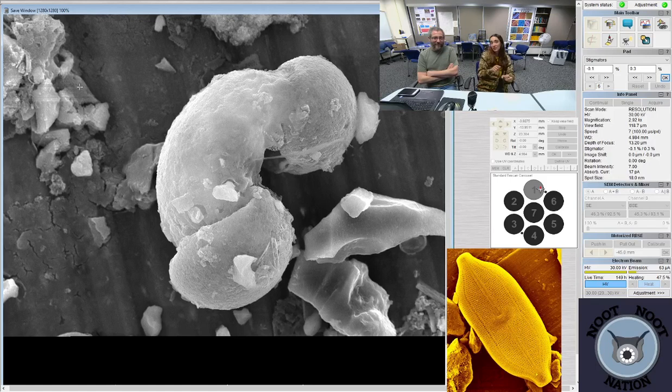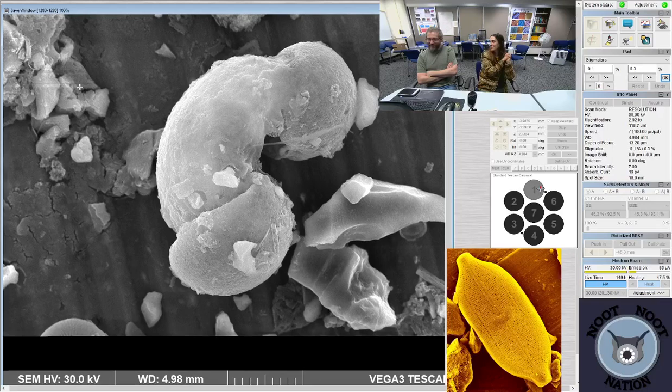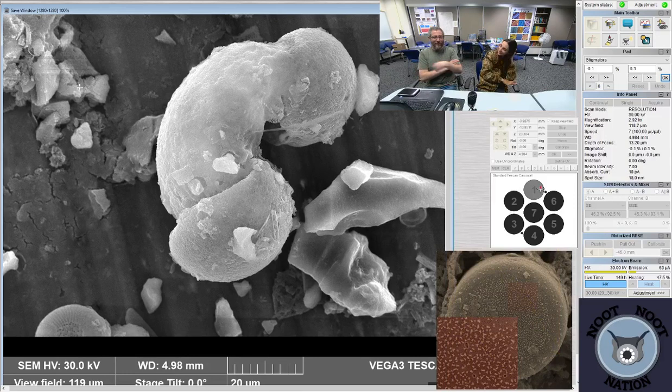It was like, if you didn't take all the carbonates out and then you put the acid in, it's going to explode. And I was like, okay, oh my god. As opposed to what we do in our lab, which is like, we'll just squeeze a little of this in and stick it on a shelf and come back in like 2 weeks and it's done.